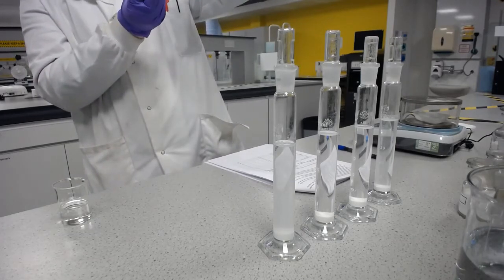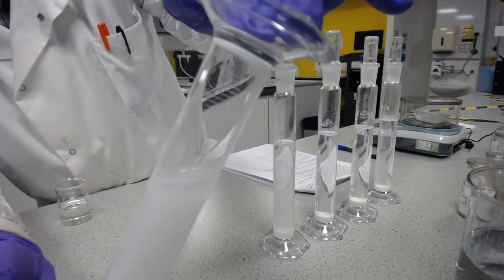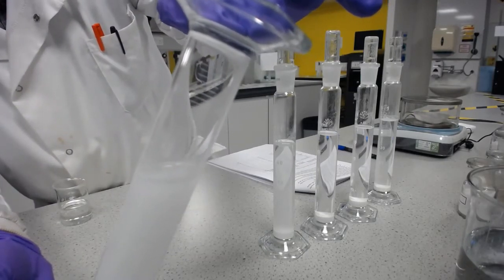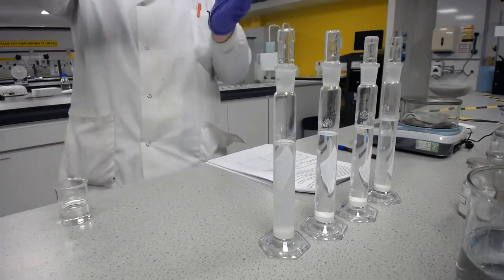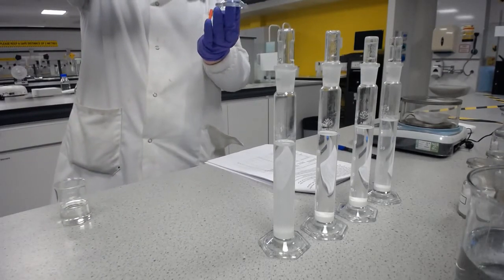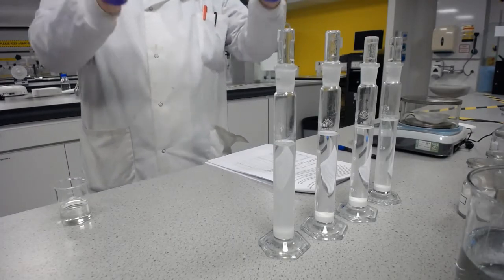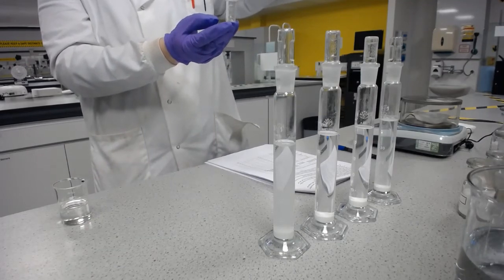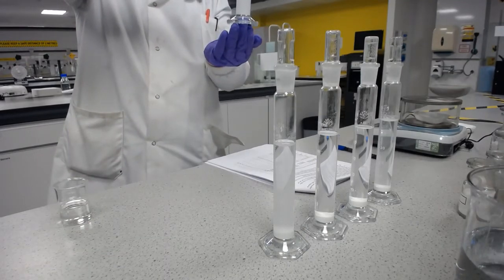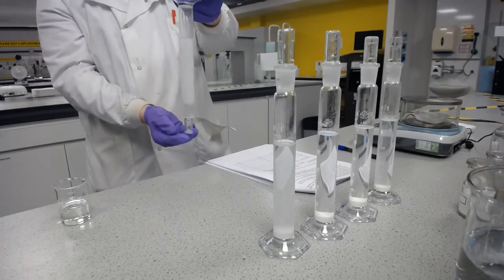So that's one inversion. Now, hopefully you can see at the top, there's still that bit of maybe caking that I spoke about. That's two inversions. 3, 4. Let me do it in front of the camera.